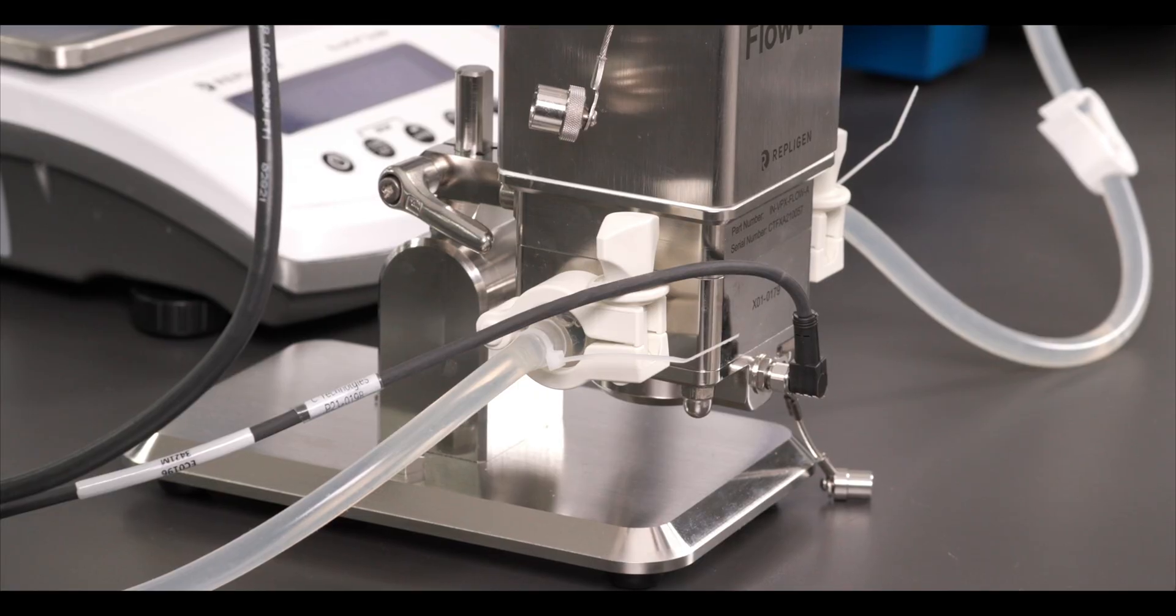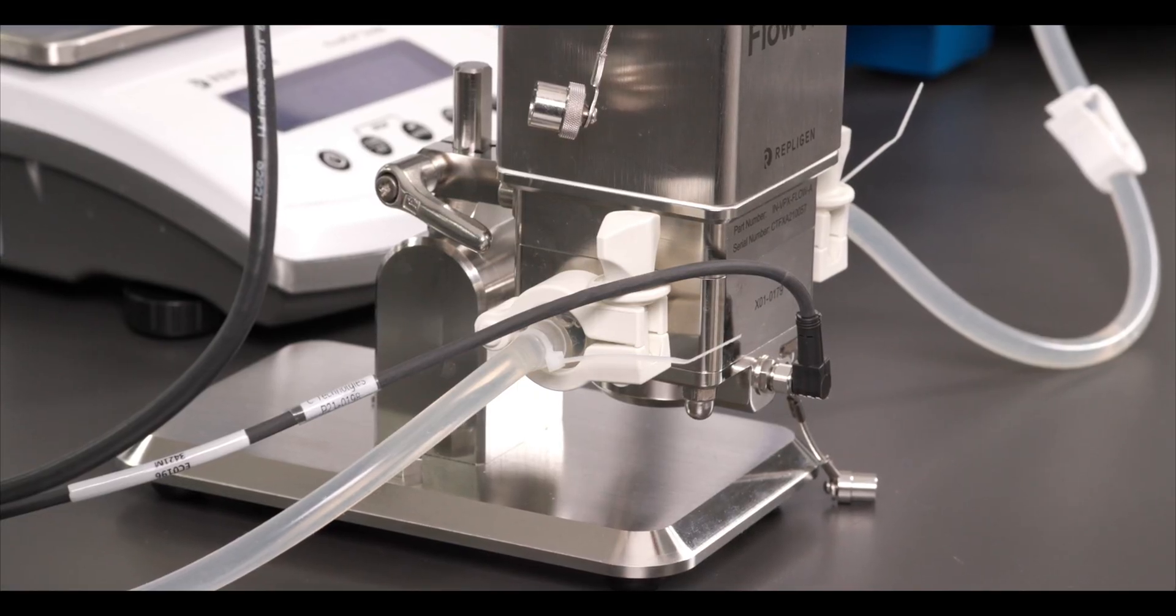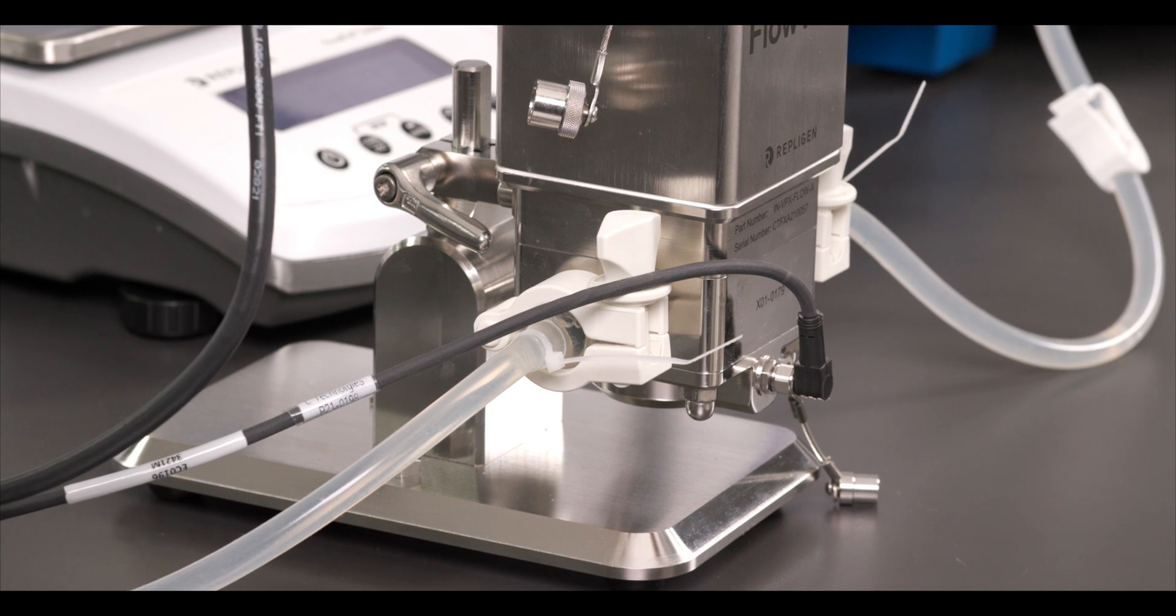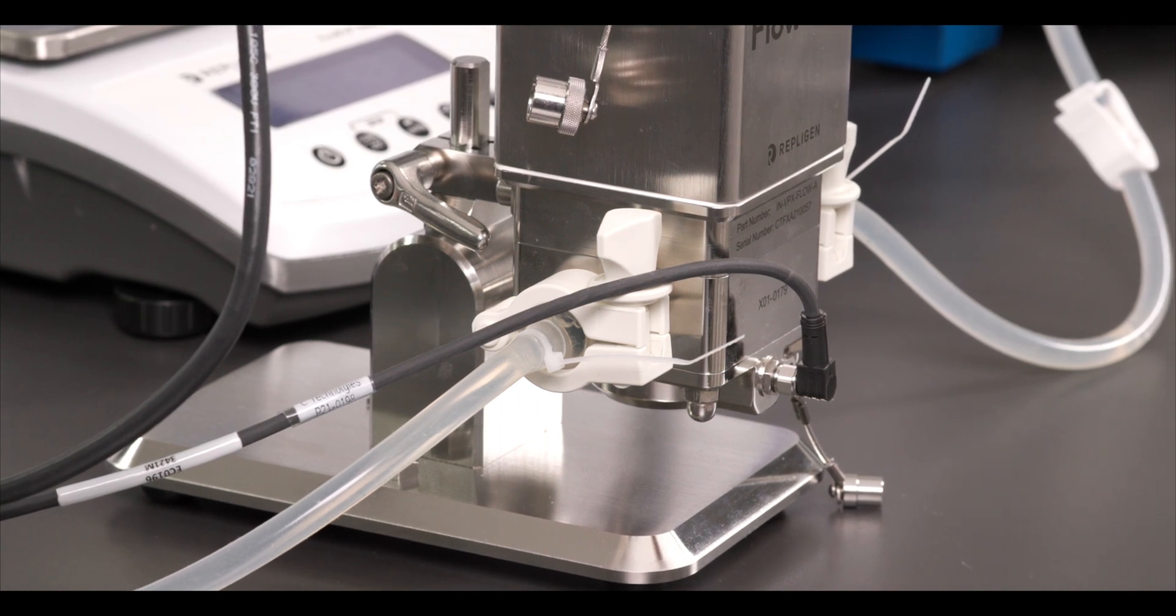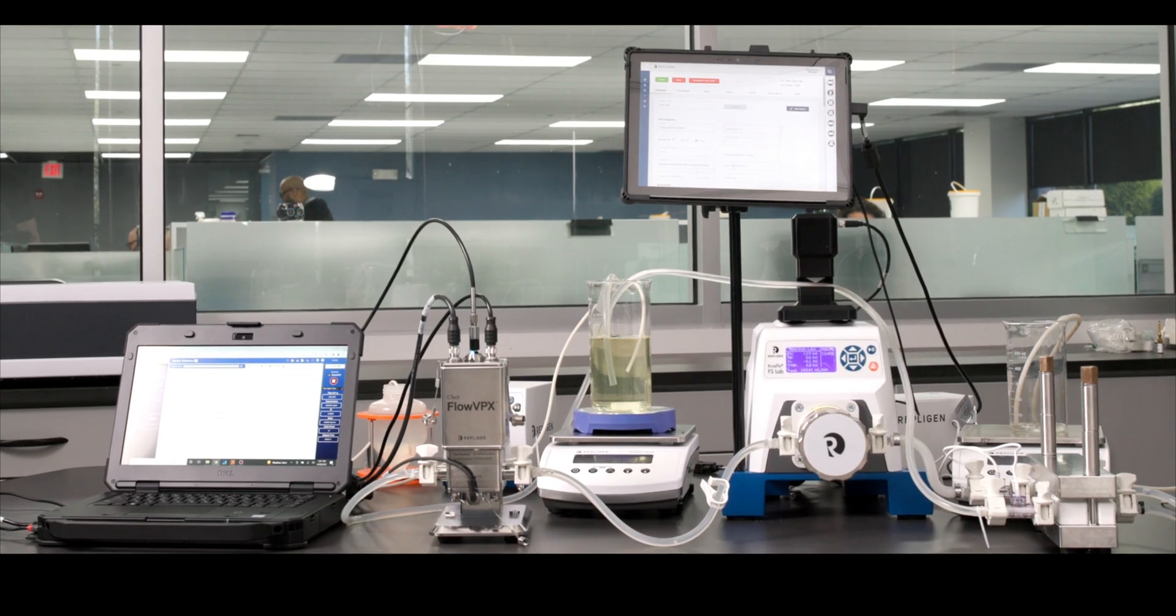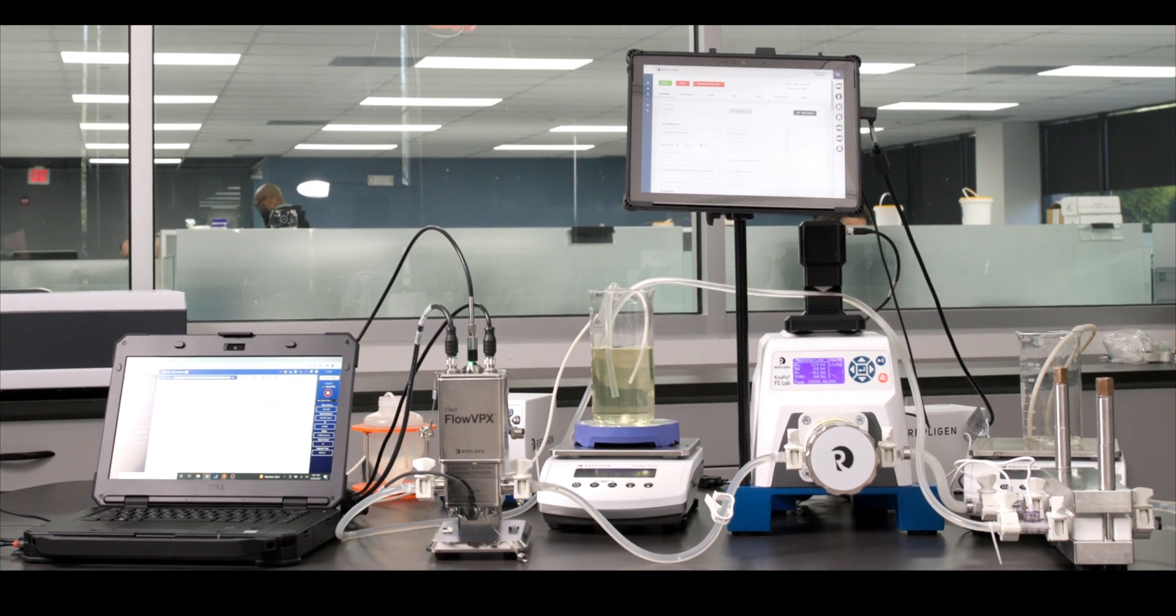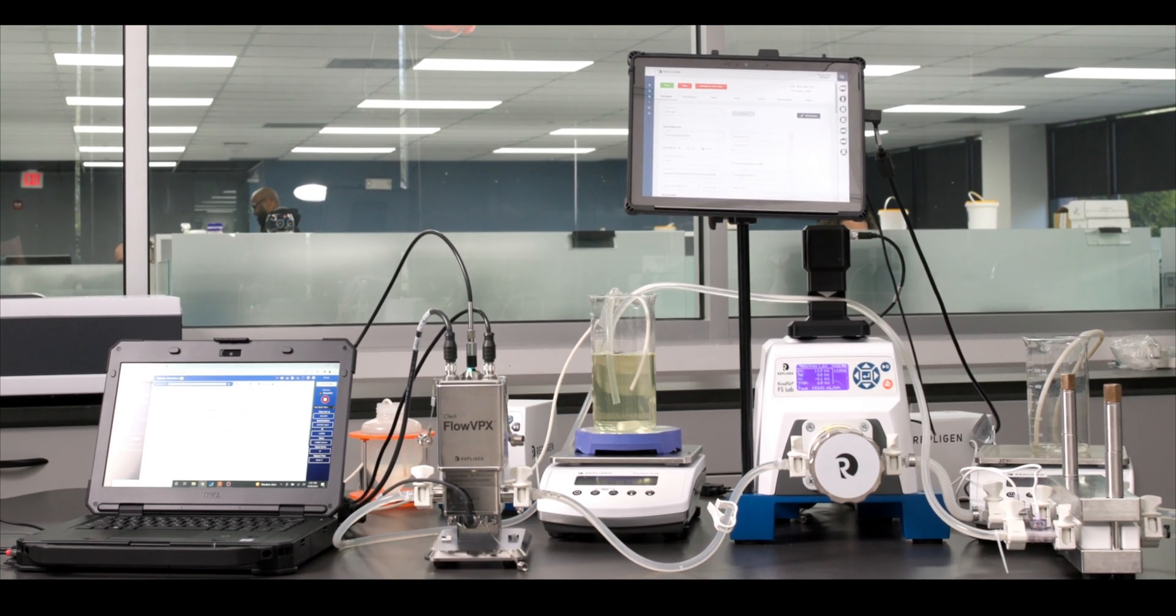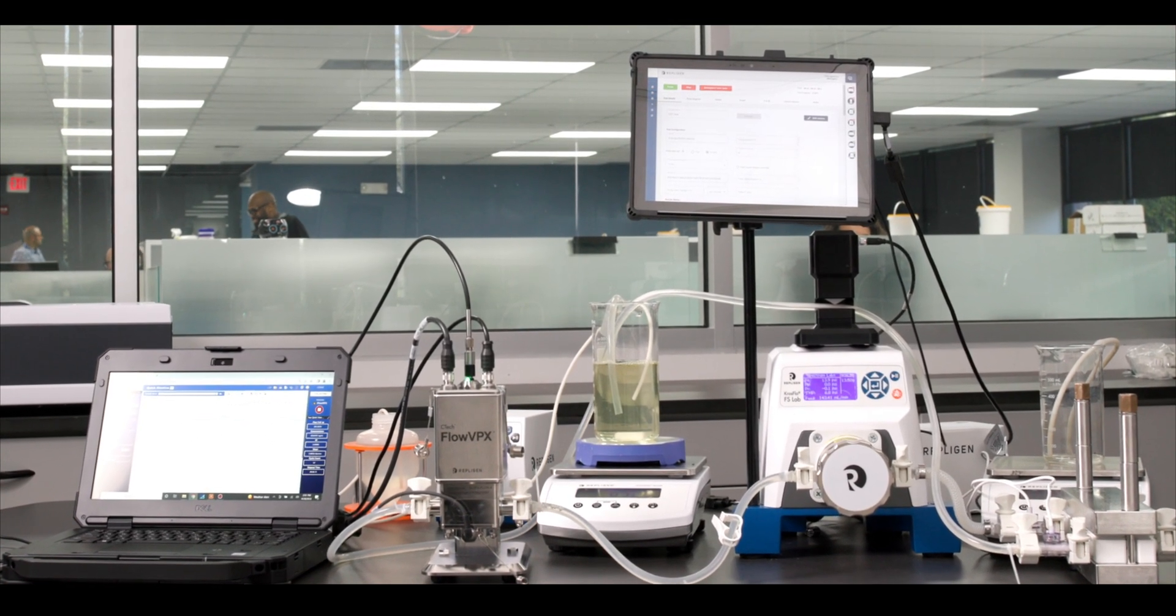The FlowVPX 10 mm flow cell uses half inch tri-clamp connections to easily connect to any lab skid. We recommend connecting the FlowVPX system after the retentate vessel and before the parasaltic pump to avoid pulsation.